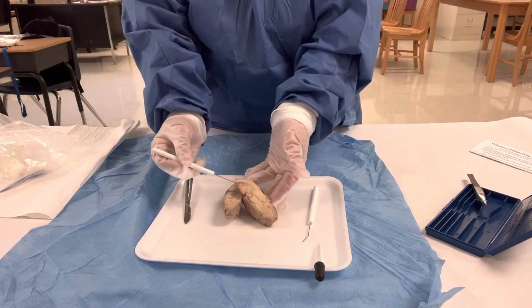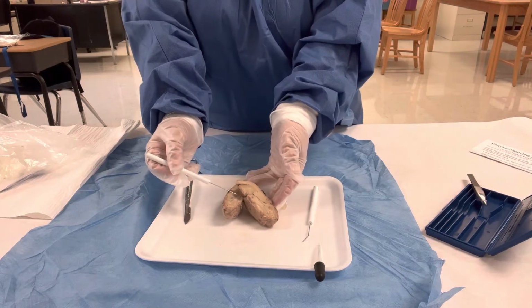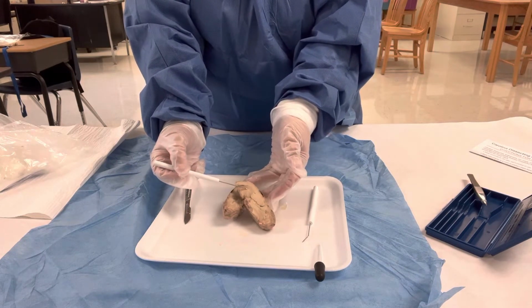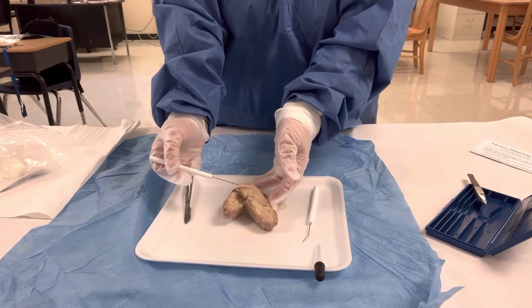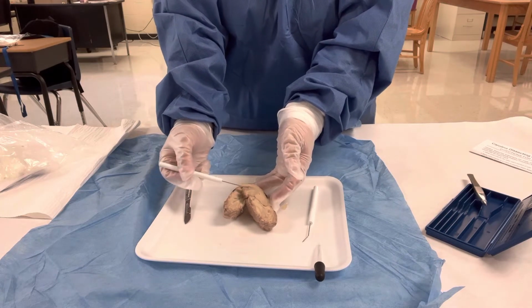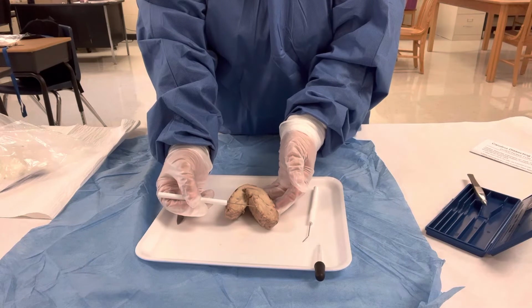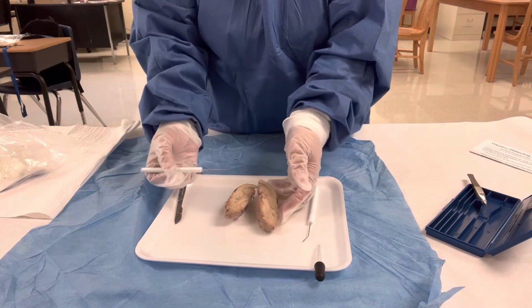Here is again the cerebellum. You have gray matter inside there, which are the areas of the brain and spinal cord. They contain cell bodies, dendrites, and unmyelinated axons. And then you have the white matter, which is bundles of myelinated, I don't know, axons. You have the, oh Lord, where is this? Okay. Almost.